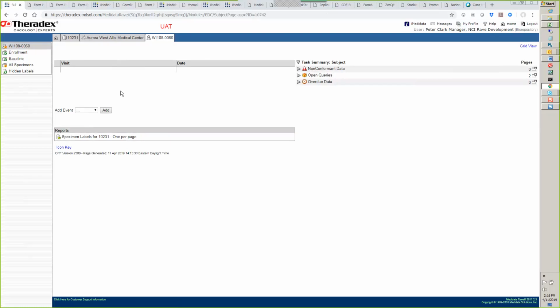So, Peter, this is Michelle Rudek at Hopkins. Yes, Michelle. So right now, I guess I have a client administrator role with read-only access. So in the case of pharmacokinetics, we not only need the specimen part, but also the dose administration time, which seems to be in a separate tab. So is that something that you would customize for a lab like ours, or is that something that we would still need a client administrator role to be able to see the dosing time?